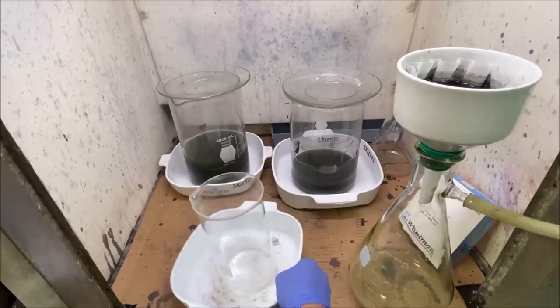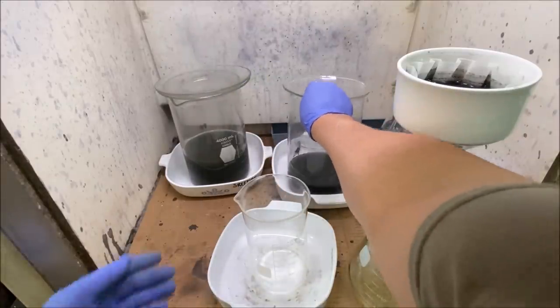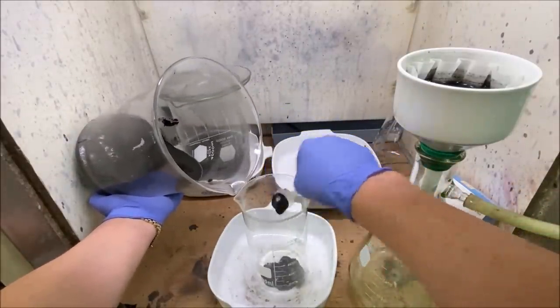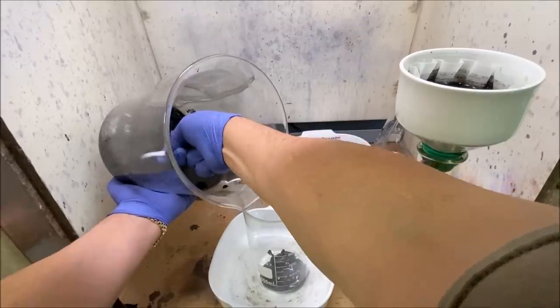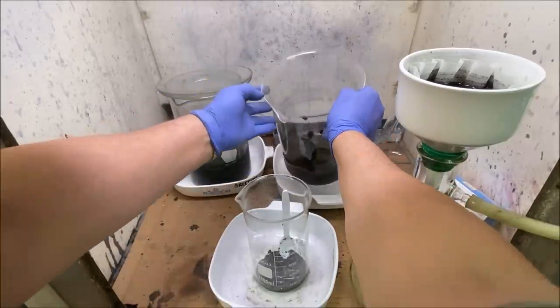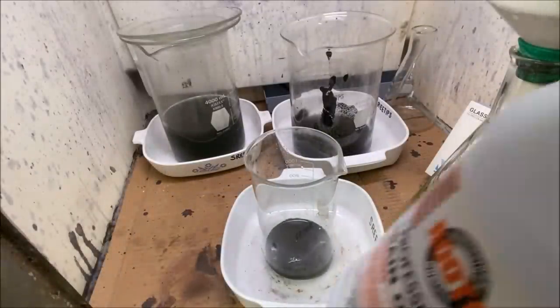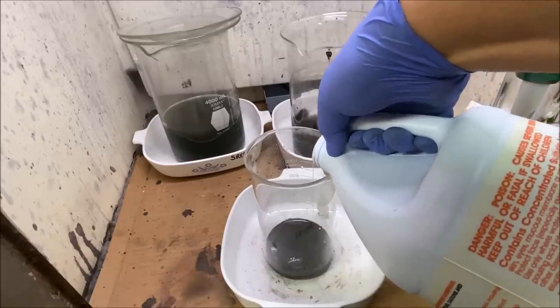So now I think what I'm going to have to do here is just go ahead and start transferring this solid material in here, a little at a time, and hitting it with the piranha juice, and then pouring it through our filter. Alright, we're going to add some sulfuric acid to this. Pour it in real slow. Careful, careful.